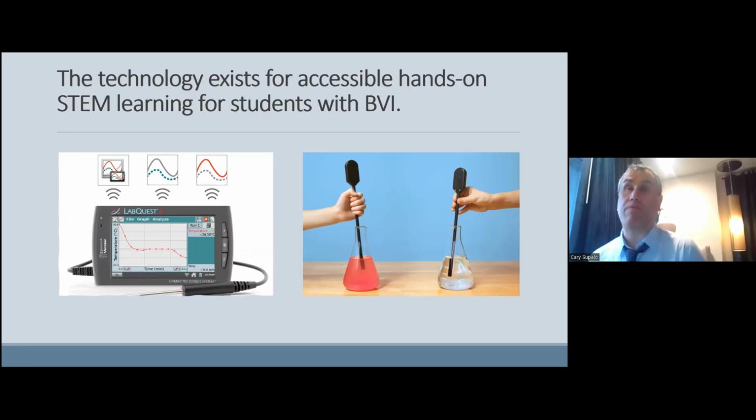you name it, we probably have a gas chromatograph, spectrophotometers, and they all work in different ways. Some of them you get actual spoken quantifiable data points. Others you get graphical information. So with the graphics, Dr. Wright mentioned the use of sonification in her remarks.